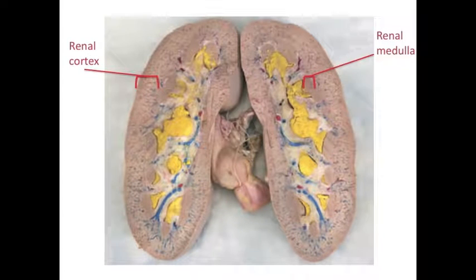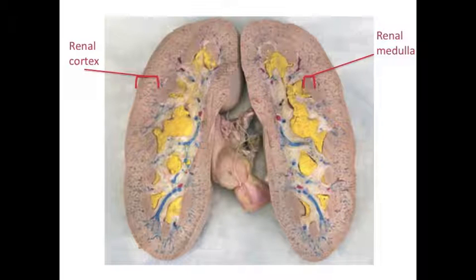This kidney has been injected with three different synthetic materials. The red material represents arterial blood flow, the blue material represents venous blood flow, whereas the yellow material represents the filtrate.